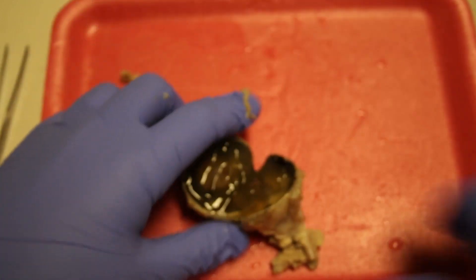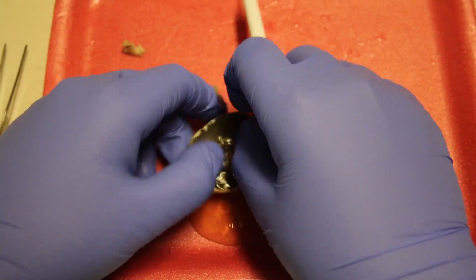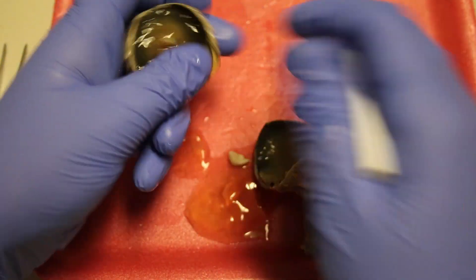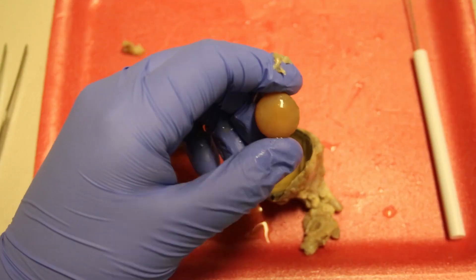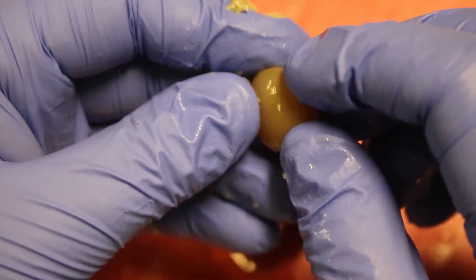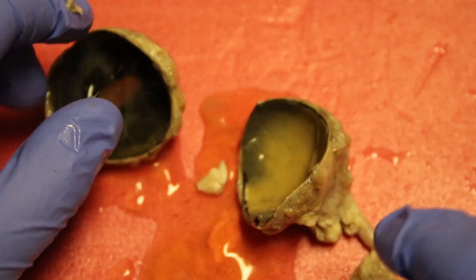Now that the eyeball is cut in half, we can take our teasing needle and forceps and remove the vitreous humor. The best way to get it out is to tease it out with your teasing needle — you can also use your fingers a little bit. Also in here we have the lens, which is what focuses light and allows the eye to see. In fresh cow eyes it's usually clear and you can actually see it magnify. If you let it dry out overnight, you can see this a little bit better.